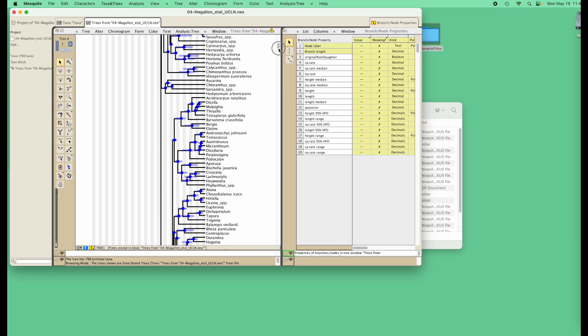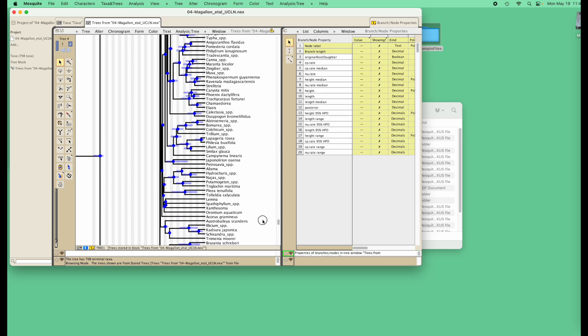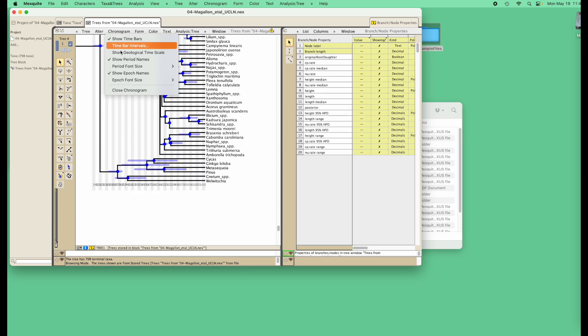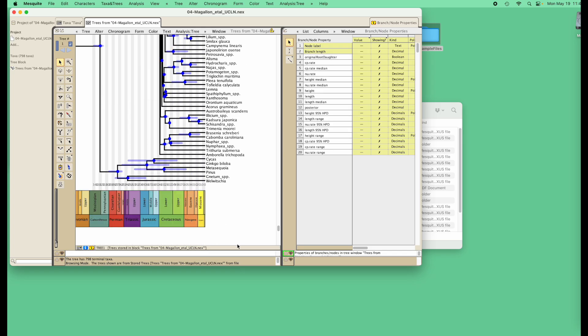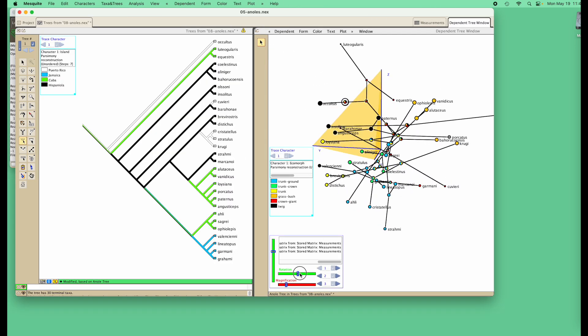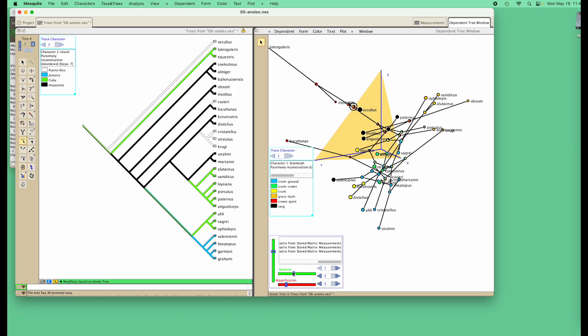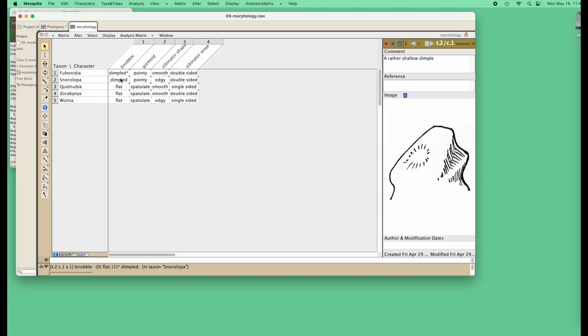We've also enhanced reading and display of trees coming from programs such as BEAST. Of course, we've kept Mesquite's features in the management, analysis, and visualization of continuous data and morphological data.